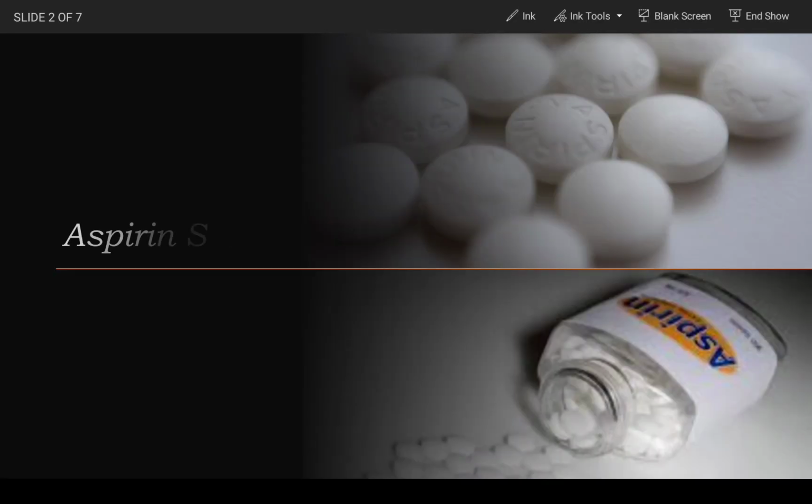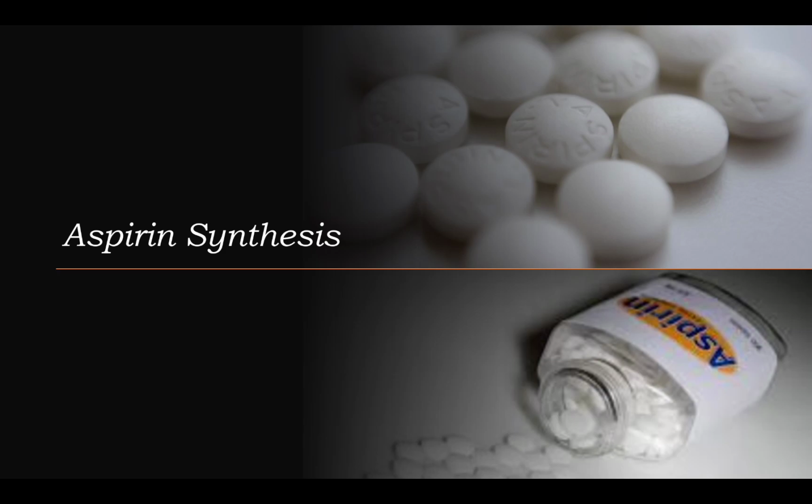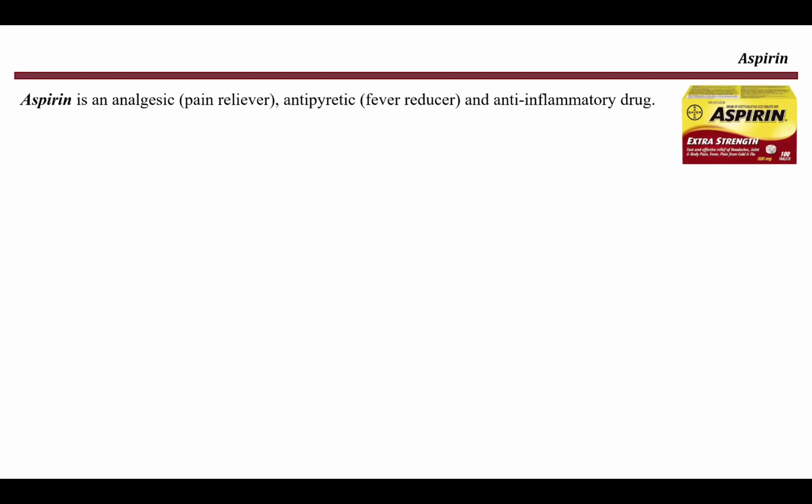In this video, I will talk about aspirin synthesis. What is aspirin? Aspirin is a well-known drug. It is used as an analgesic, a pain reliever, a fever reducer, and an anti-inflammatory drug. The active ingredient in aspirin is acetyl salicylic acid.